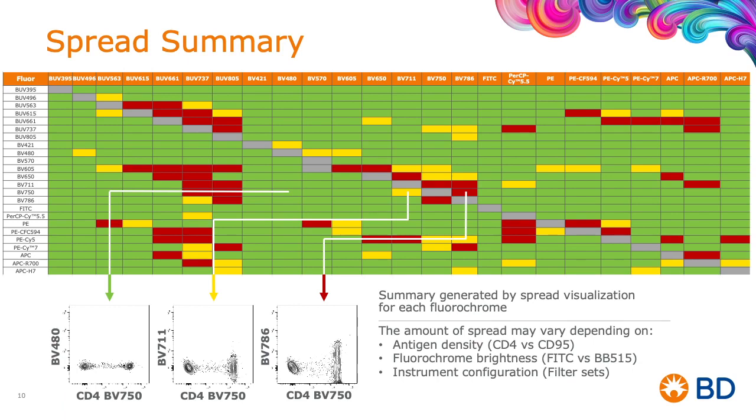The filter set, for example, that you use in your instrument may have an impact on the amount of spread.